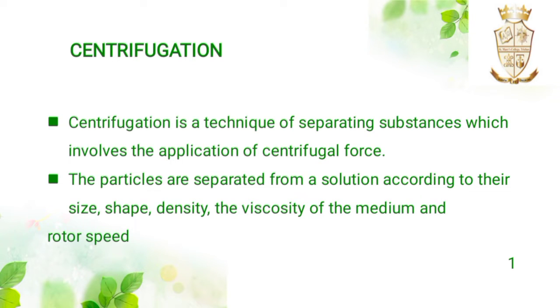Centrifugation is a technique of separating substances which involves the application of centrifugal force. The particles are separated from a solution according to their size, shape, density, the viscosity of the medium, and rotor speed.